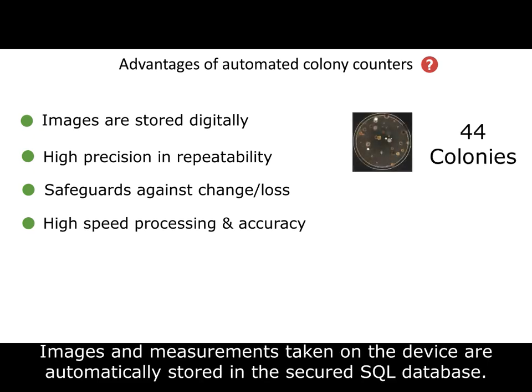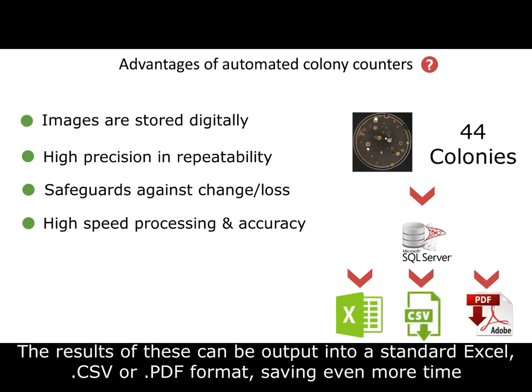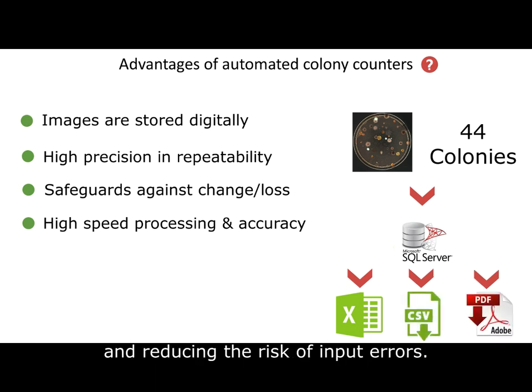Images and measurements taken on the device are automatically stored in a secured SQL database. The results of these can be output directly into a standard Excel, CSV or PDF format, saving even more time and reducing the risk of input errors.